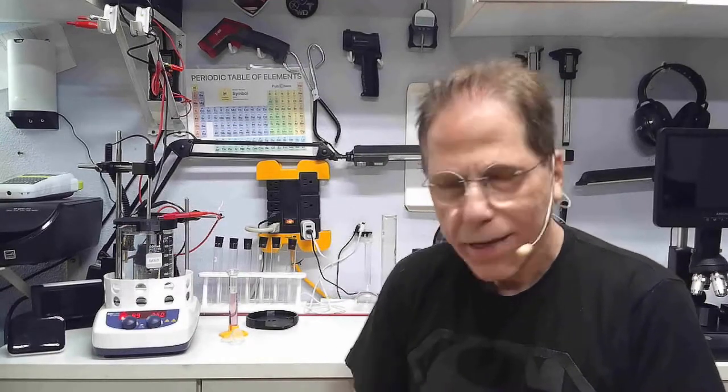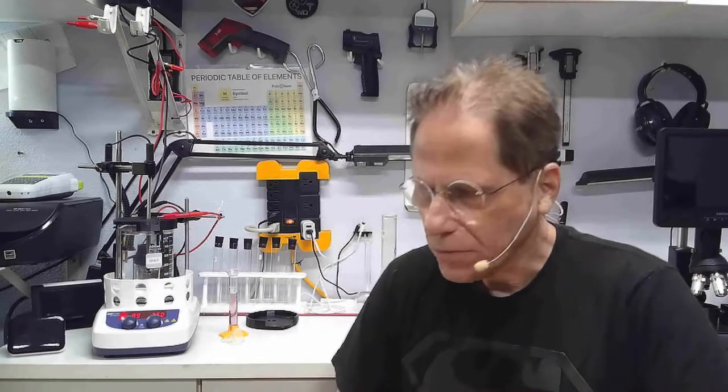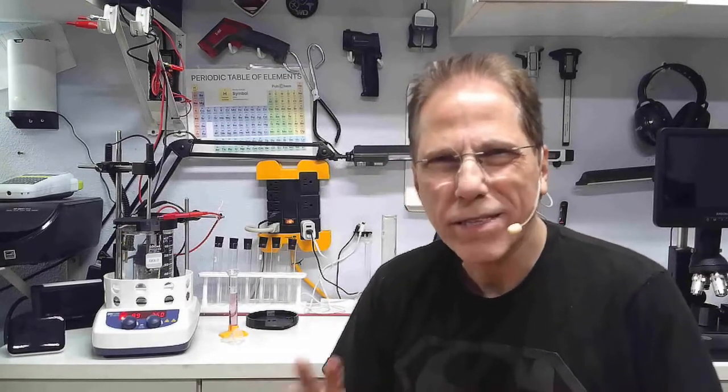Welcome to Reality Creative Video. I'm Hermes, and today I want to talk to you about creating the best colloidal gold you can possibly get. I'll give you some tips and tricks because if you've started to create your own colloidal gold, you might have found some inconsistencies. After you've cooked several batches, you found out they're not all exactly the same. How do you get that ruby red colloidal gold? It seems to vary.